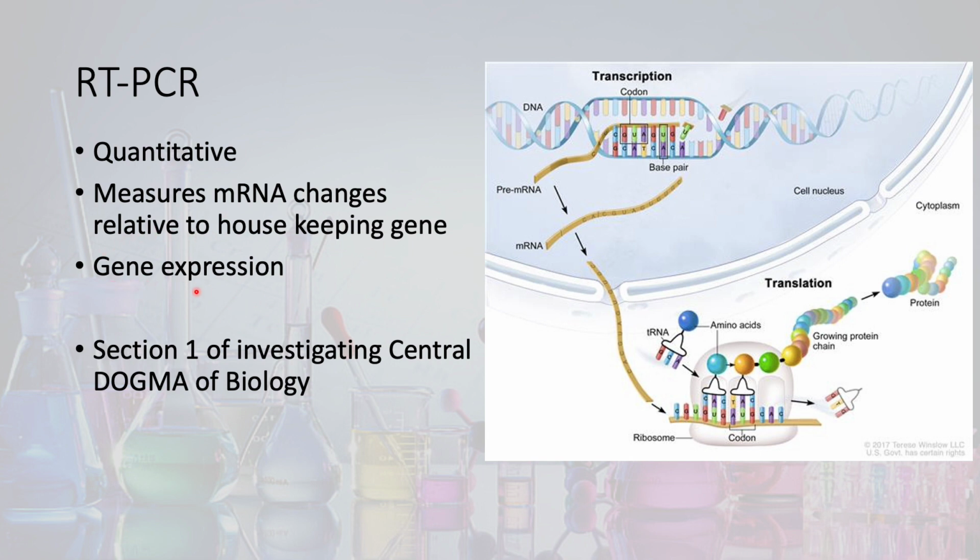Ultimately, this allows us to measure whether genes are being transcribed more or less, or perhaps not changed at all, right? It lets us measure quantitatively or semi-quantitatively the effects our environmental toxin will have on gene expression, whether that drug or toxin makes it go up or down.